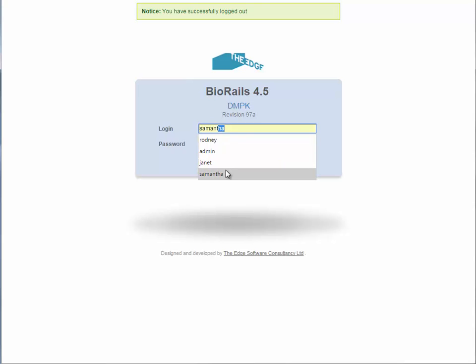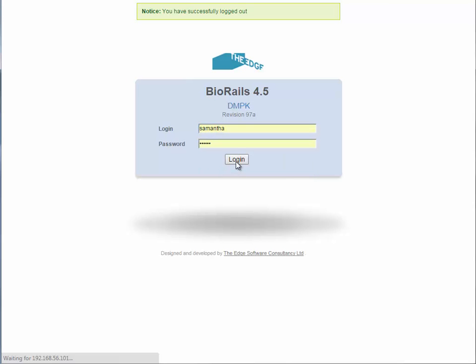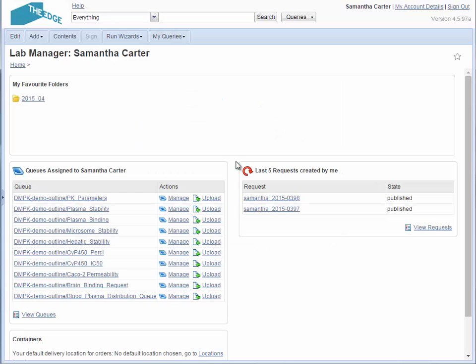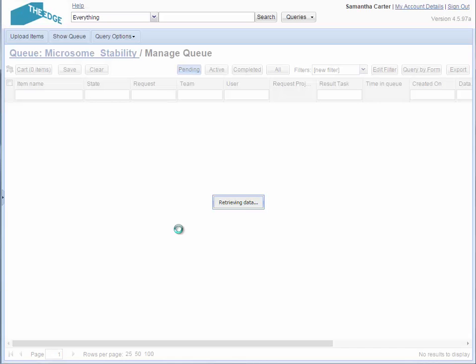I will now be signing in as Samantha Carter. She is the DMPK manager responsible for organizing the DMPK lab's work. I look up the microsome stability queue to see the new items on the queue.